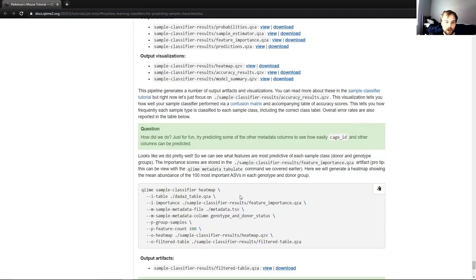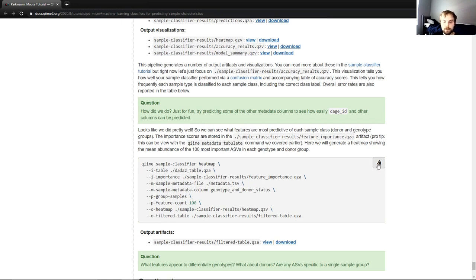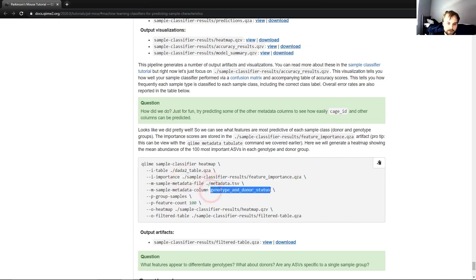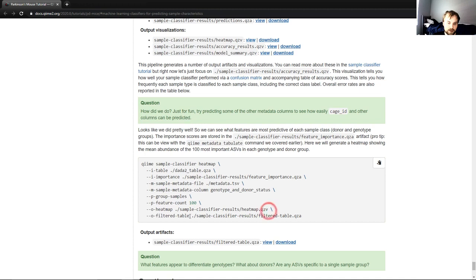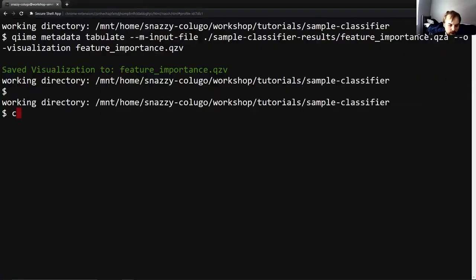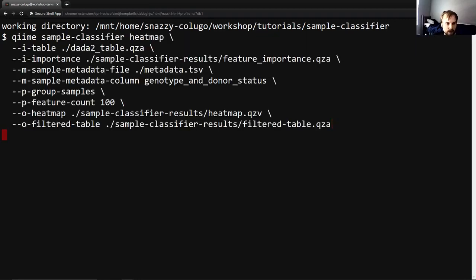Here we will generate a heat map showing the mean abundance of the 100 most important ASVs in each genotype and donor group. This will allow us to visualize the data we just tabulated in a more visual manner as opposed to simply reading through numbers, which humans are notoriously bad at. So this will again take our feature table. It will take our importance artifact that we just viewed. It will take our metadata and it will take the column again, as well as some more technical information. And then also our outputs. We're going to output heat map QZV and a filtered table QZA. And this is the one that we really care about here because we'll be viewing it after we run the command. So I will copy the command.